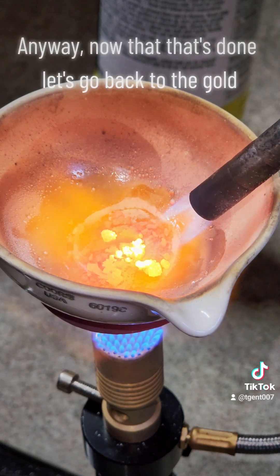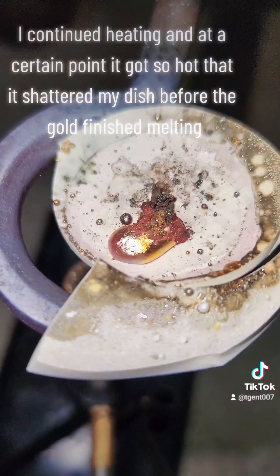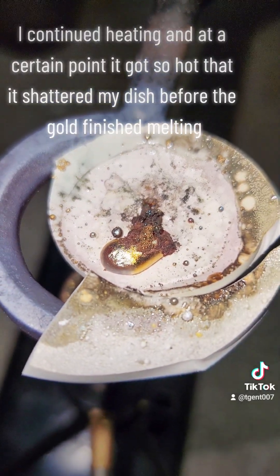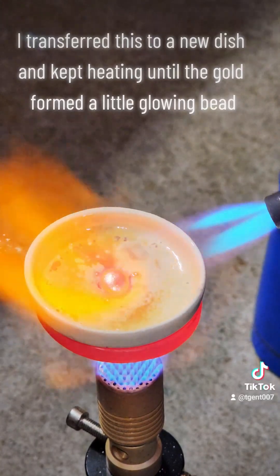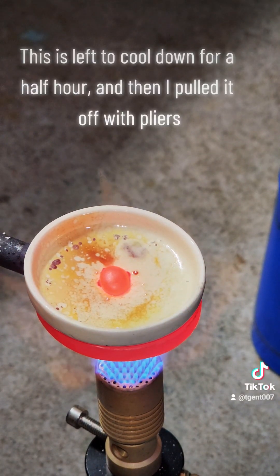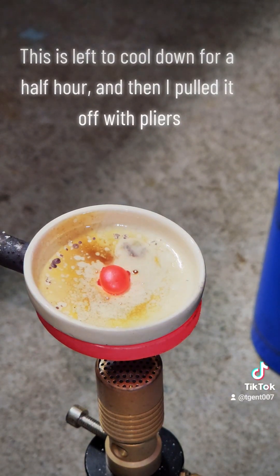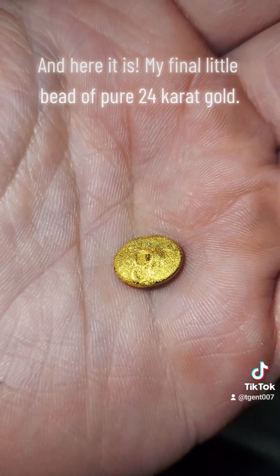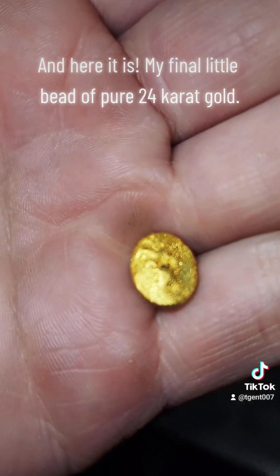Anyway, now that that's done, let's go back to the gold. I continued heating and at a certain point it got so hot that it shattered my dish before the gold finished melting. I transferred this to a new dish and kept heating until the gold formed a little glowing bead. This is left to cool down for a half hour and then I pulled it off with pliers. And here it is — my final little bead of pure 24 karat gold.